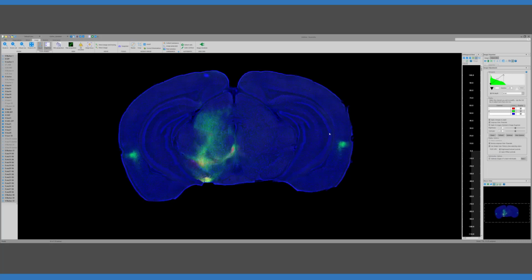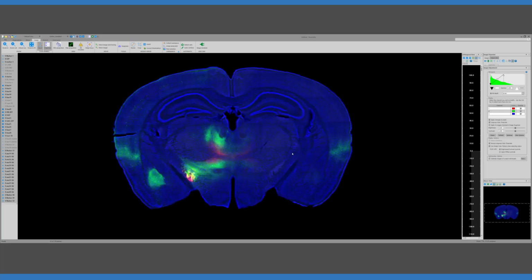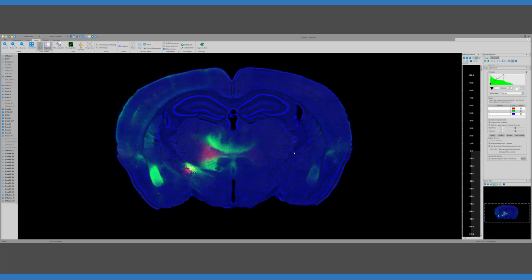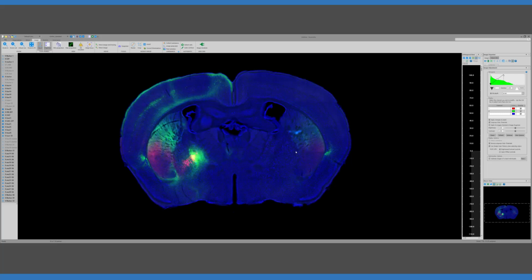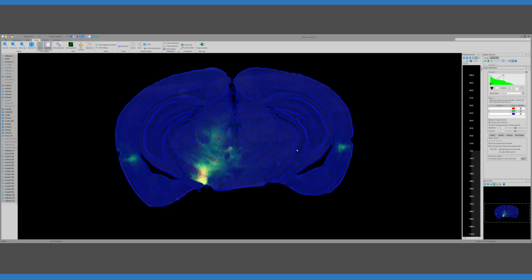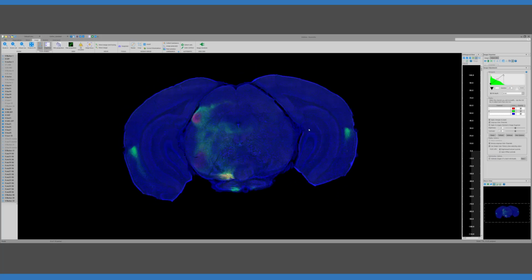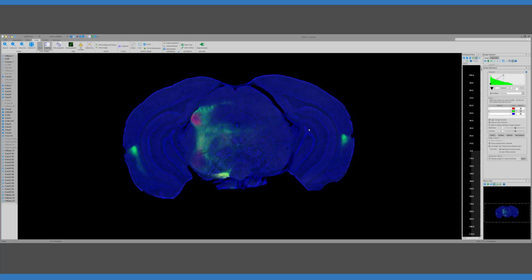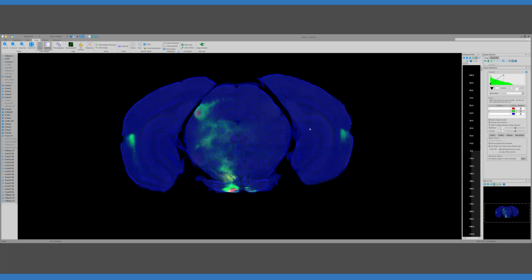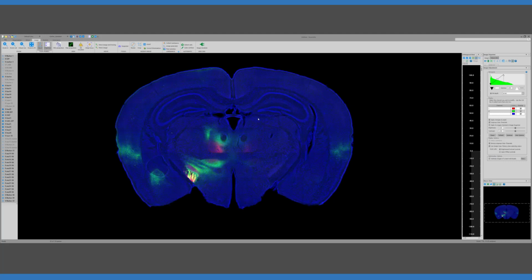So Chip, these images, these sections that we cut are 50 microns, and these are imaged with a 10x objective. Oh, so it's resolution that's sufficient for doing things like cell detection and characterization of these projections. Right, and seeing the axons, which I'll show next. So this enables us to scroll back and forth through the different sections to go to the area that you want, and you can see that they're well lined up one to the other.